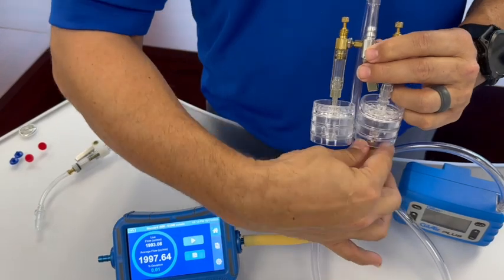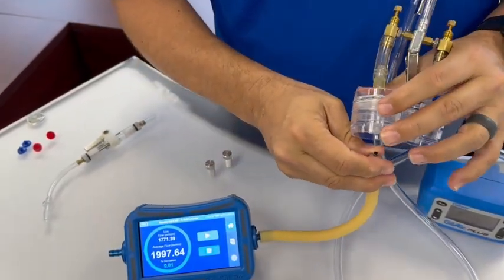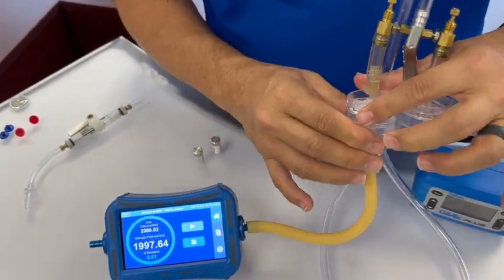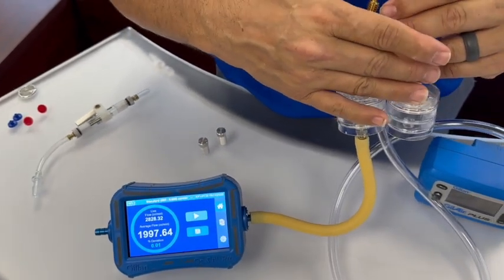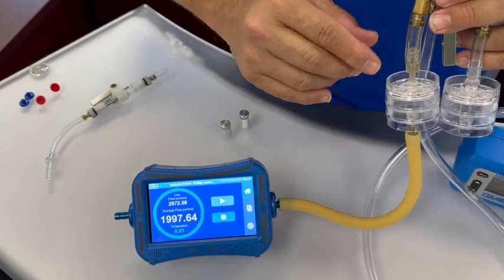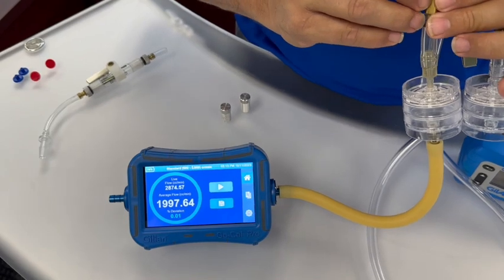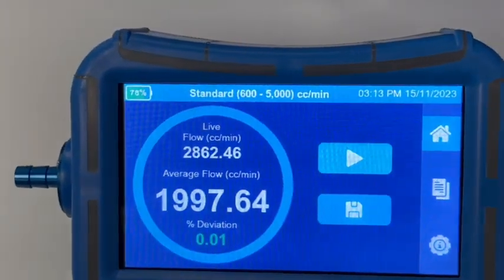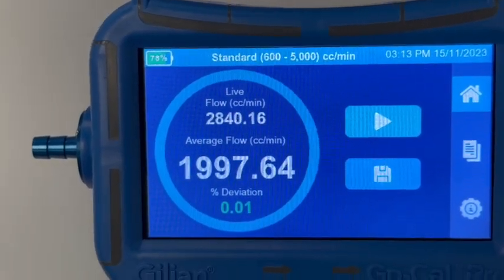Now that we've verified the flow rate on the second cassette, we're going to disconnect the tubing and connect it back to the first cassette. You want to do it in this order because once you've made the adjustments to the second one, the first one may be slightly out of adjustment. We can see our flow rate is now at 2,800 and we want to bring it to 3 liters.